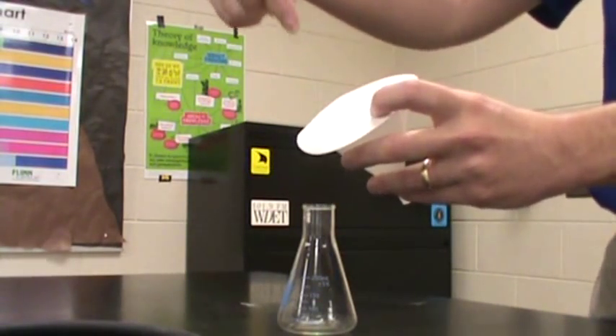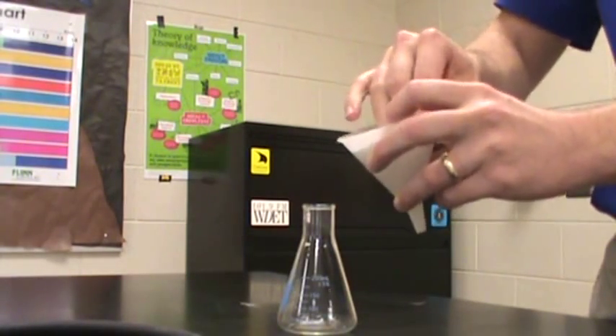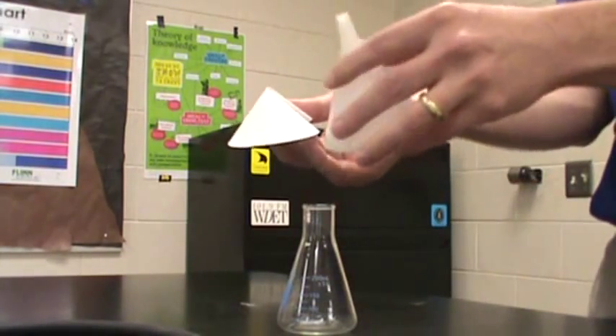And then just one finger right in the center, push down, and the filter paper will automatically take a cone shape. So just the same as this. And then you're good.